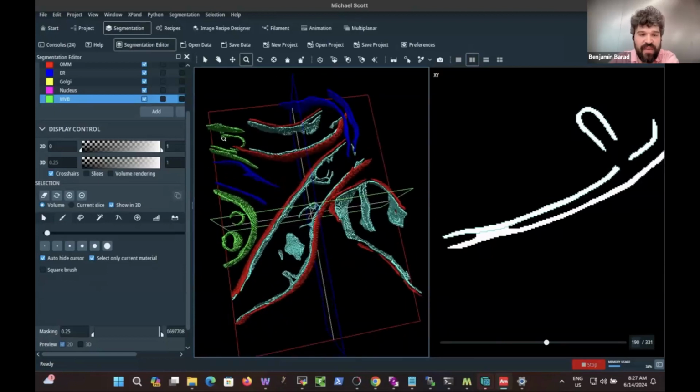We've got these multivesicular bodies that I grabbed by accident, the wrong thing. We have ER. You were asking about whether we see ER crossing over the mitochondrion. Here's a case where we're getting one of these crossover events. And you can get these very quick segmentations.